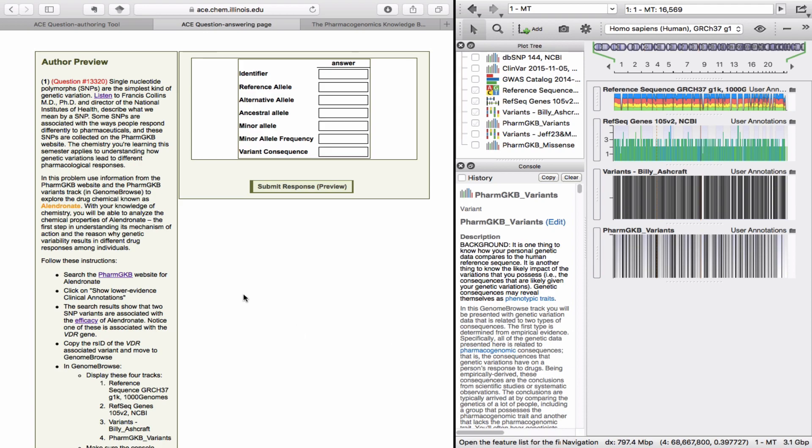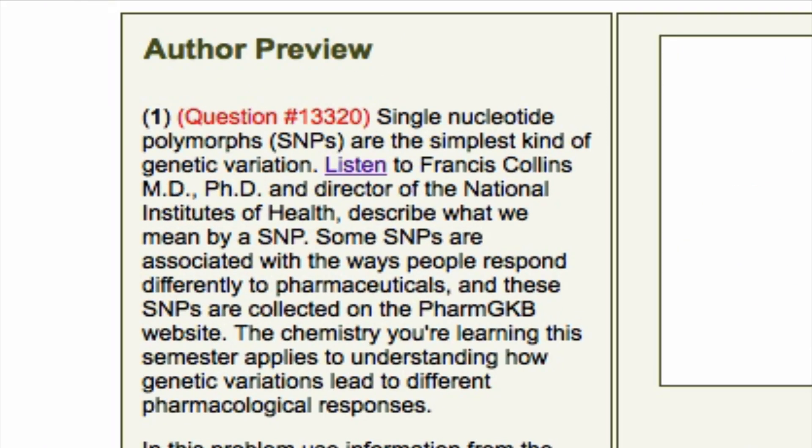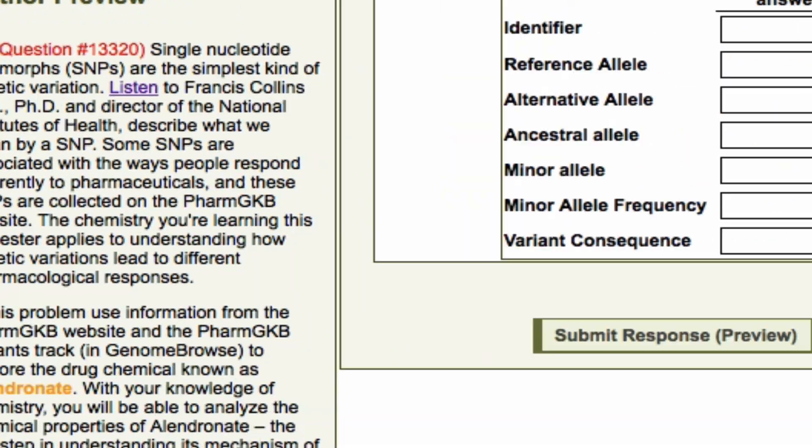This problem introduces SNP genetic variations. SNP variants can result in different drug responses between individuals. Read through the whole problem and follow this video to get the most out of it.